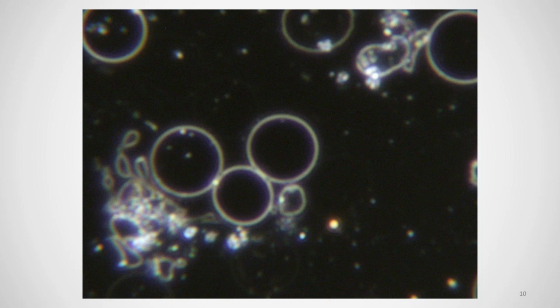Then the system is also equipped with a 100 times objective, which is quite specialized. Using the 100 times objective, we're able to get this type of magnification on the screen. So this is about a 4,000 times magnification. And the 100 times objective is quite a specialized objective. It has a built-in iris diaphragm that allows you to control or regulate the amount of light going through the objective, allowing you then to get a very high degree of clarity in images as well.